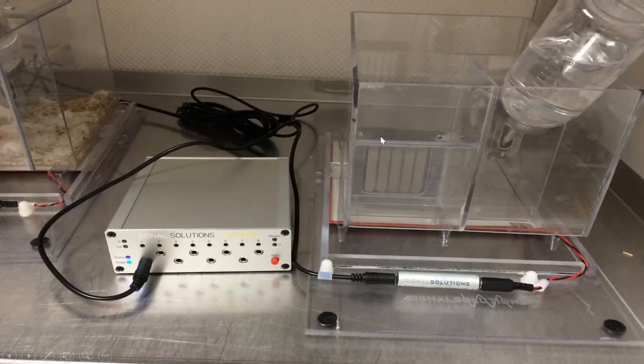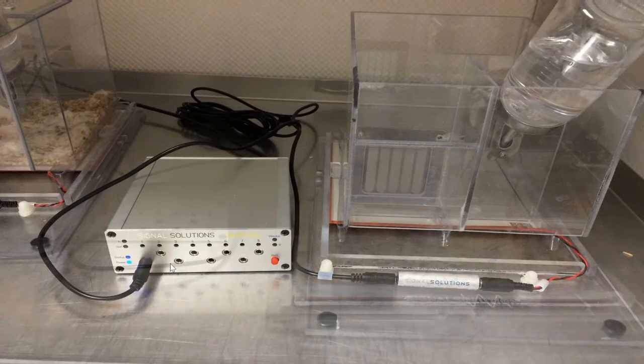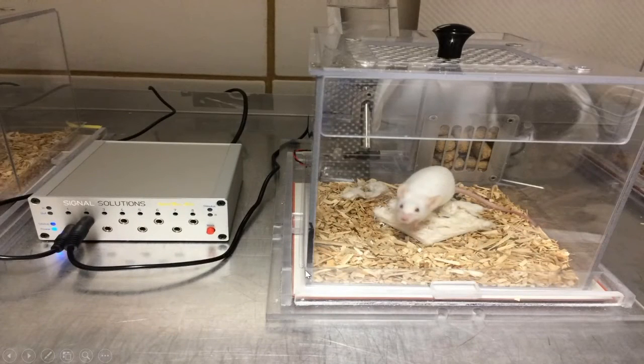So once you put the cage on top, plug everything in to the DAC, and then you can place your mouse in. I didn't show earlier, here's the mouse shield, you can barely see it along here on the bottom, which contains all the bedding. Some people have worried, does the bedding dampen the signal? It turns out that when the mouse is right on top of the bedding, that signal goes right through to the piezo film, right through the cage shield, and we see almost no loss of signal. People have used all different kinds of bedding, and it has not been a problem; we get good signals with pretty much any kind of bedding, if people want to use nestlets or little igloos and so on.